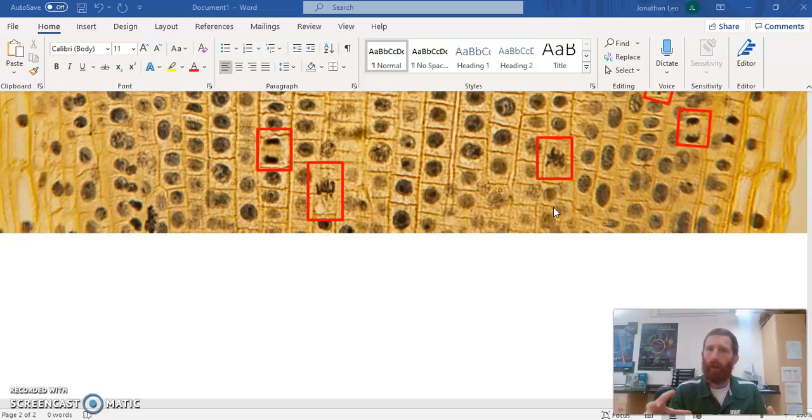For interphase, you can't see the chromosomes, but you see the nucleolus. For prophase, you can see the chromosomes starting to condense. We see little dots, little spaghetti noodles, white space in the nucleus. Metaphase, obviously, chromosomes are lined up along the middle. Anaphase, chromosomes are moving to opposite sides of the cell. Telophase, chromosomes are separate in their nuclei, starting to unravel, and the nuclear envelope is starting to form. And cytokinesis, we can see a cell plate in between the two newly formed nuclei.